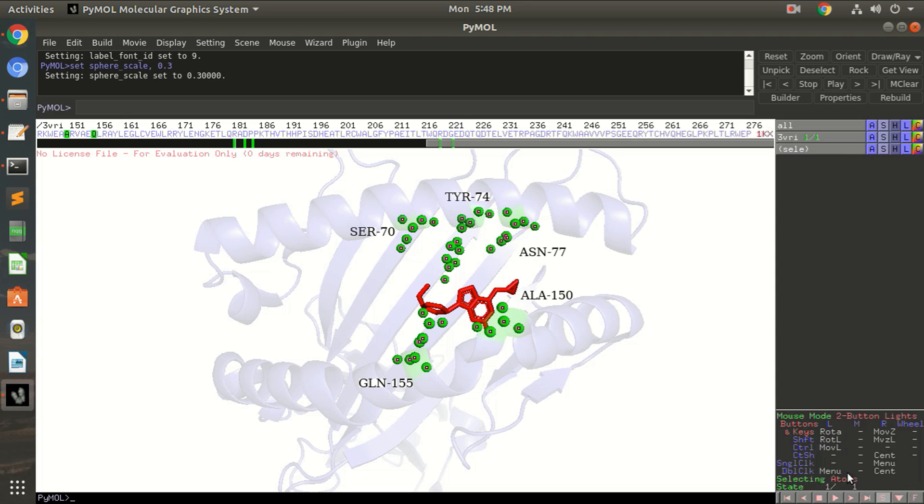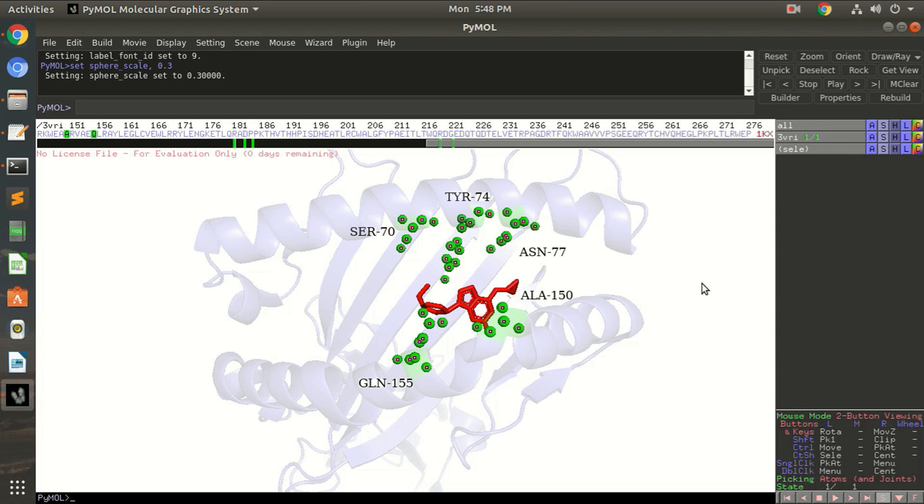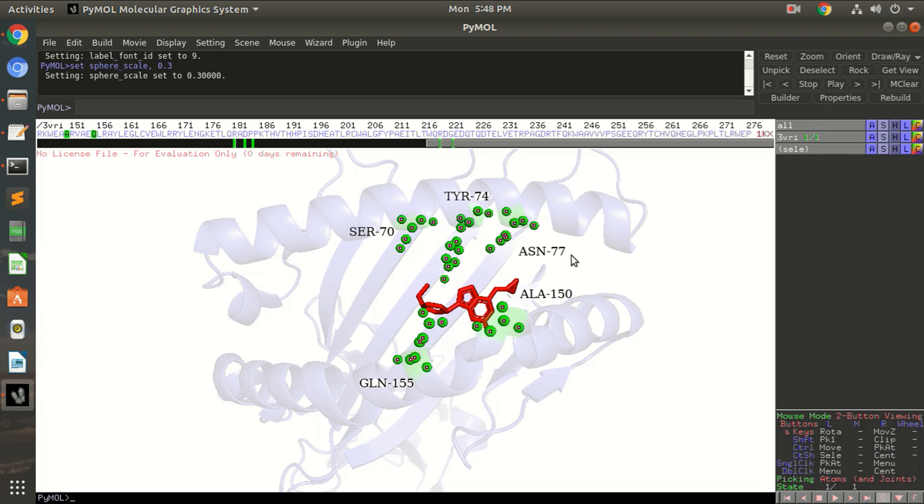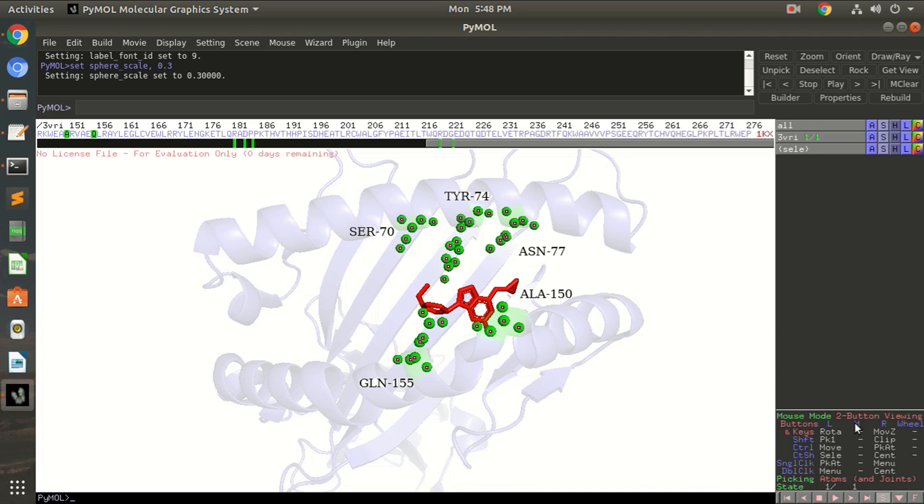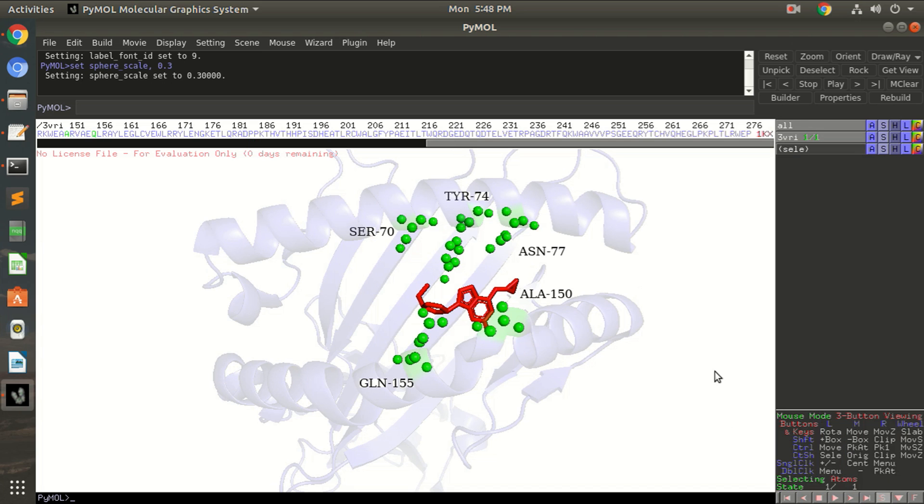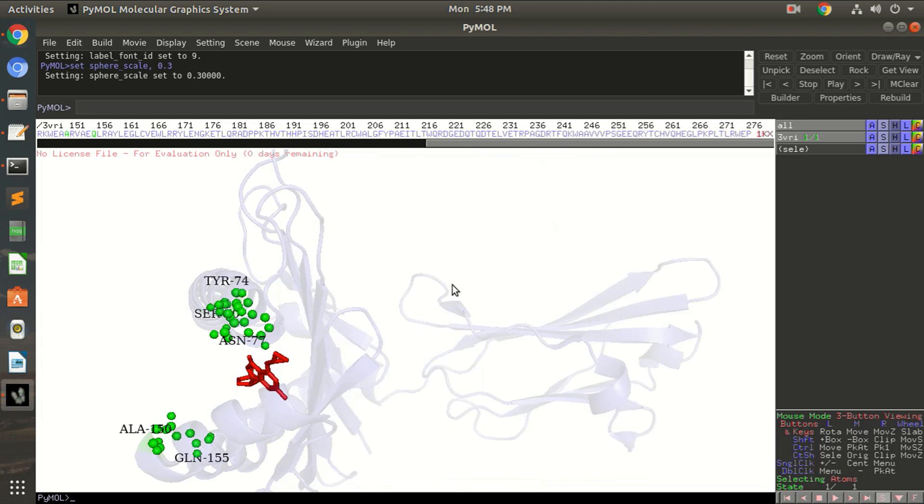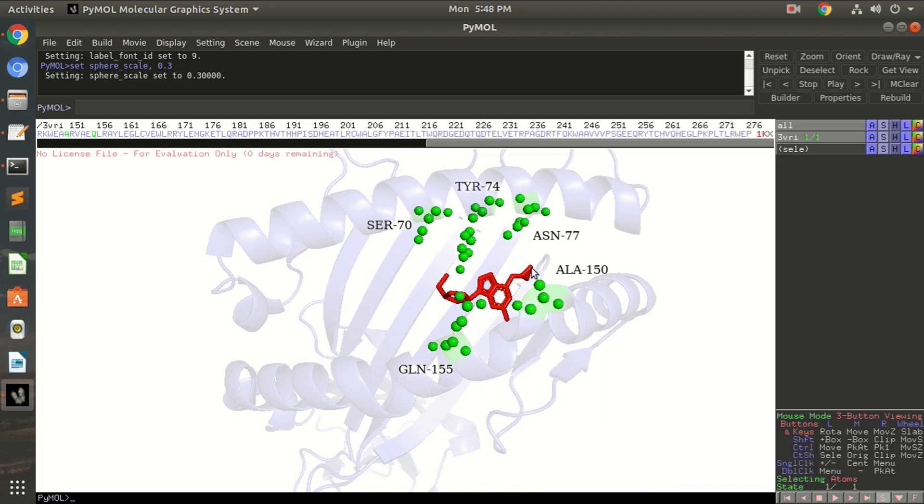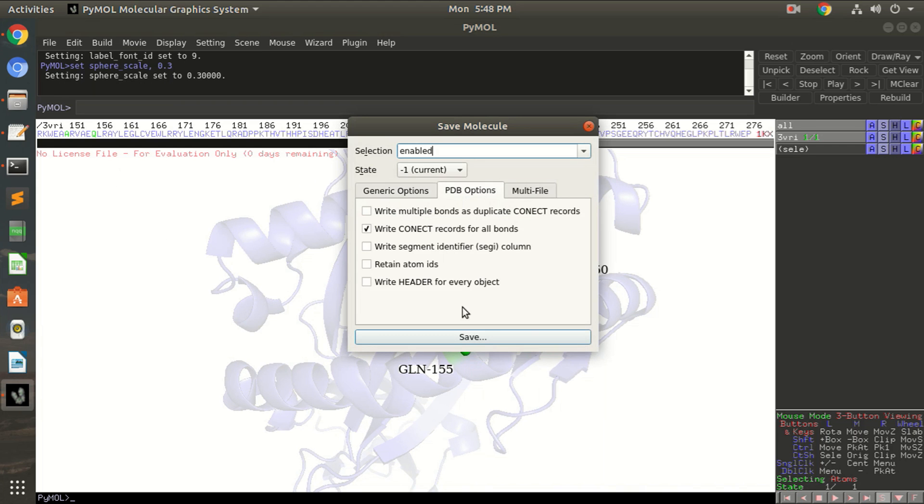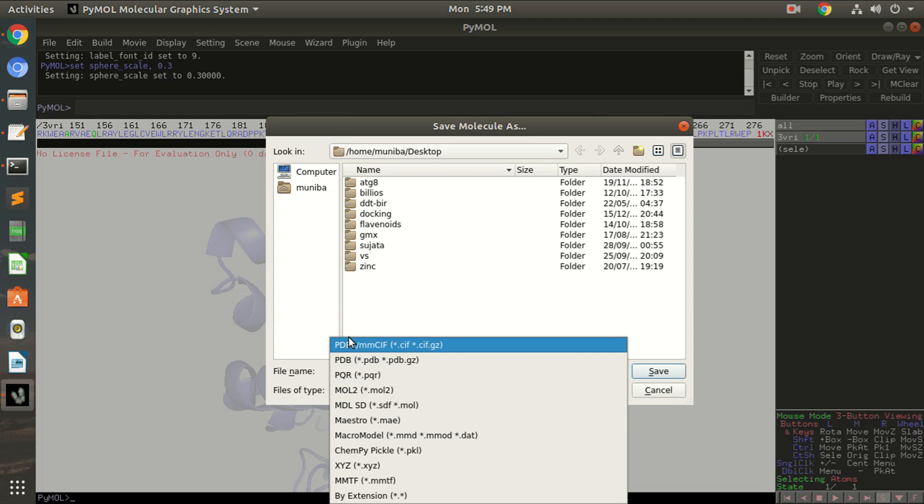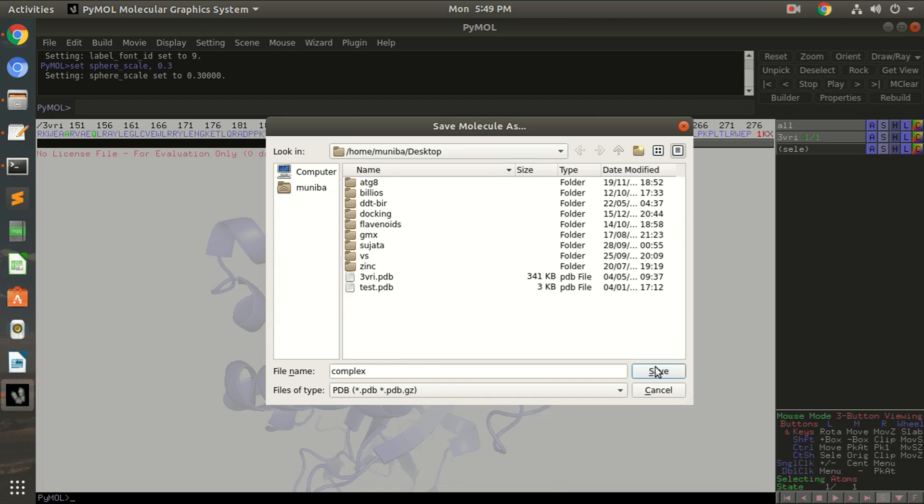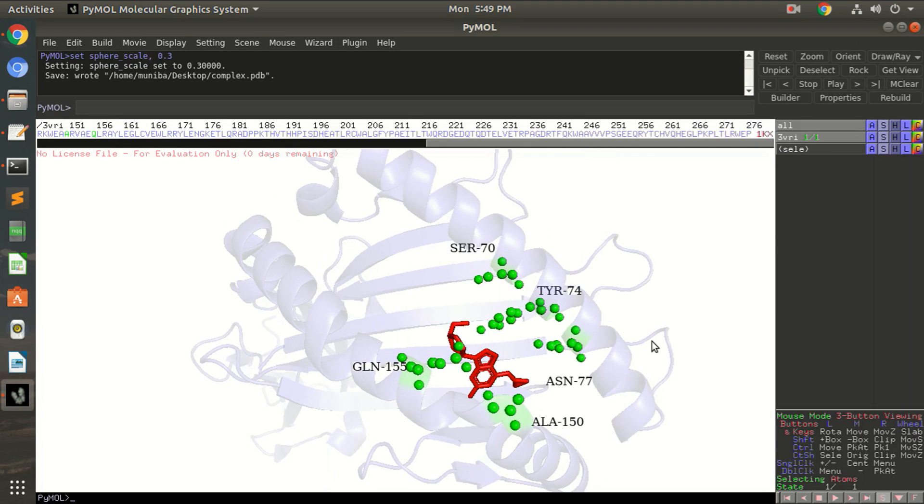2 button and then go back to 2 button viewing mode. Okay, now go back to 3 button viewing mode and you can see here you can generate the images or you can save this molecule in the PDB format. Save this as context.pdb and save.